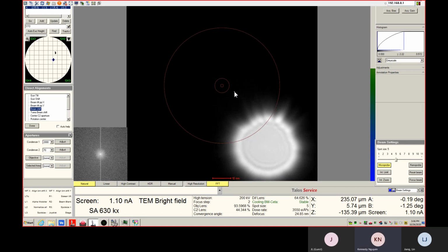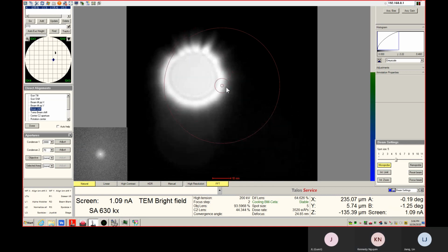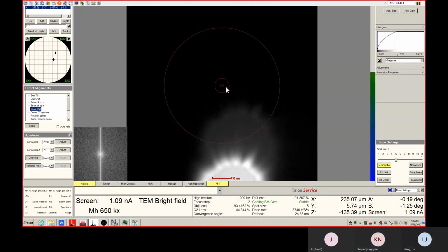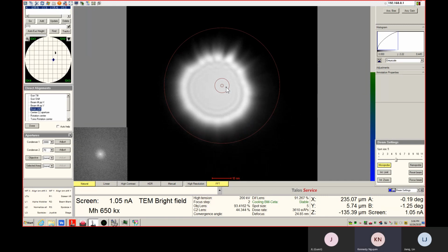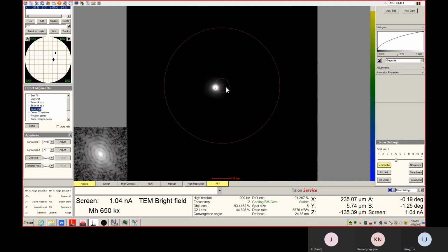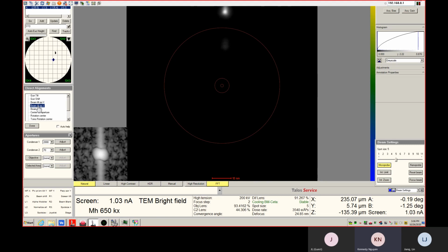So this is where we're going to stop. Bring it back to the center. We'll try to shrink the beam more if we can. Okay. PPX, okay, that looks good. PPY, could probably make it closer. Okay, cool.